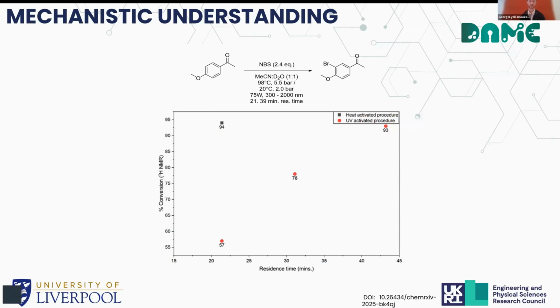However, this could be increased to 78% upon an increase in residence time and then further increased to 93% with a further increase to residence time, indicating that the reaction was not inhibited, it was just that the rate was being slowed down.